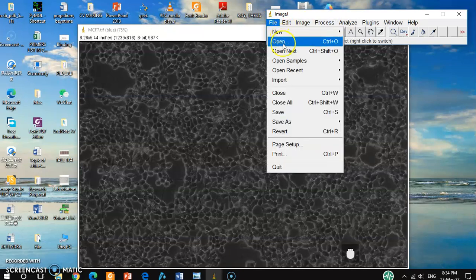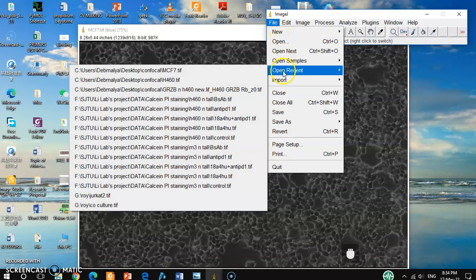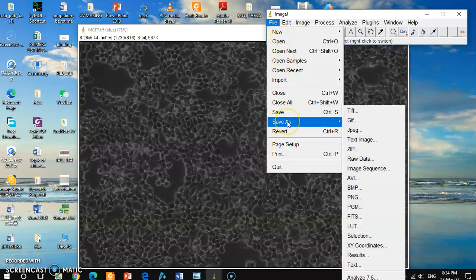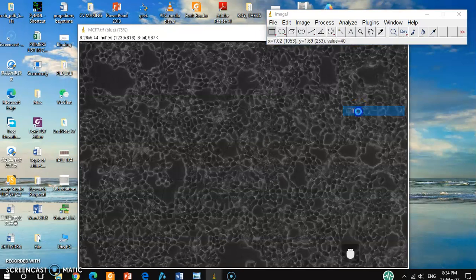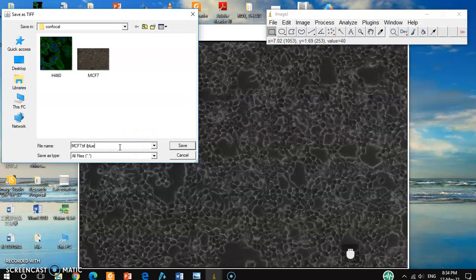Okay, so from here you can save it as a TIF file and you can save it in your folder. So later on you can use this picture for your experiment purposes, for your analysis purposes.